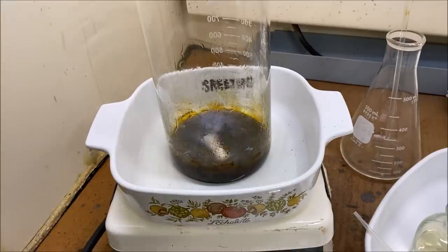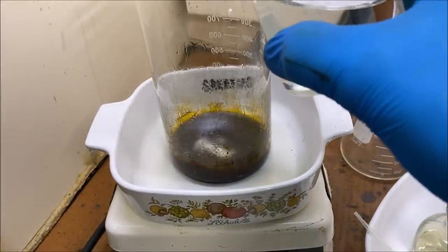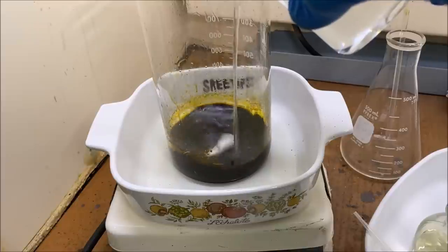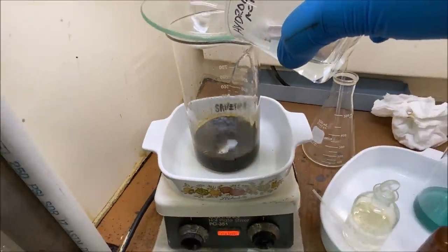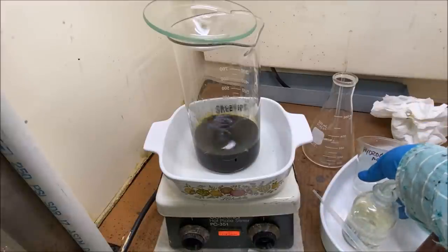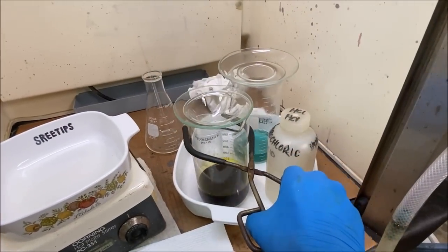Got this evaporated down to a syrup almost. And now what we're gonna do is rehydrate it with some hydrochloric acid. Just gonna pour it right on in. Kill the stir bar, kill the heat, pull this down off the heat now, and let it cool down.